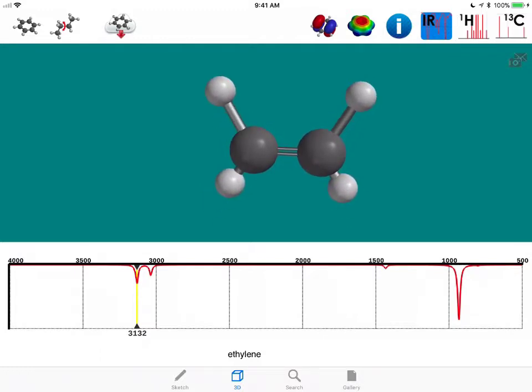And then we can move over and see at 3027, we have symmetric CH stretching happening. And again, in the IR spectrum, we're not going to be concerned with the region below 1500, the fingerprint region.